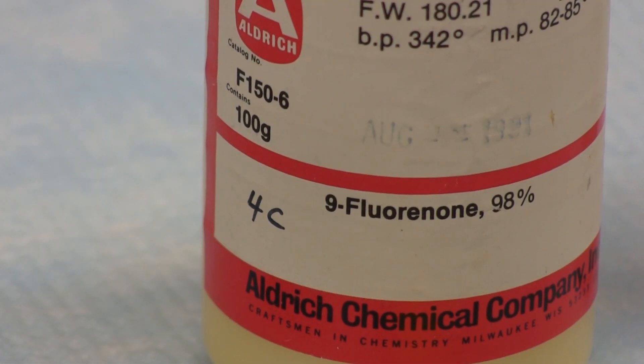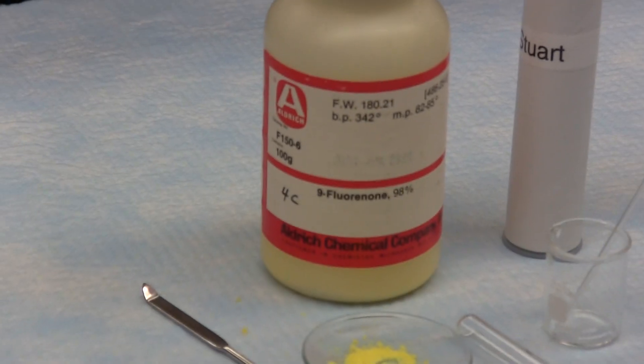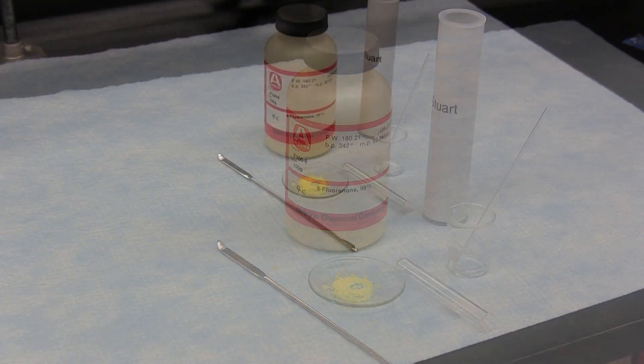In this demonstration, we are going to check the melting point of fluorenone. The literature melting point of fluorenone is reported to be around 83 to 85 degrees. So, depending upon the purity of this sample, we can expect it to melt pretty close to this temperature. The purer the sample, the closer its melting point should be to the literature value.